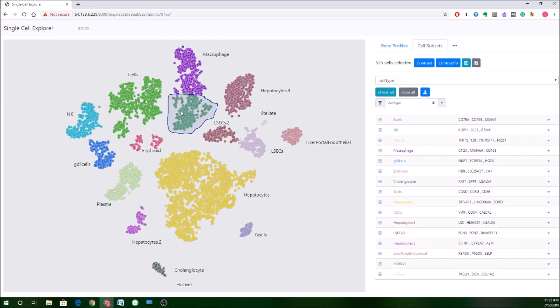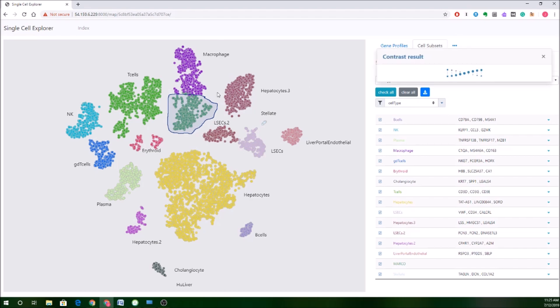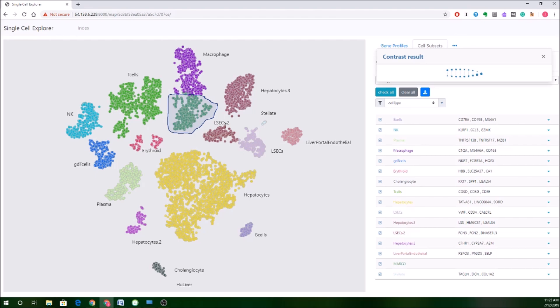Once I've selected this cluster of interest, then I can start to figure out what's distinctive about it. So I have this selection made. It will tell me that I've selected about 535 cells, and now I can click this contrast button. This will compare this cluster to all the other cells in the experiment and try to find lists of genes that most distinguish this cluster from the rest of the cells. Now, this will take a little bit of time to compute, so we can see our contrast results humming along here to let us know that the calculation is proceeding.